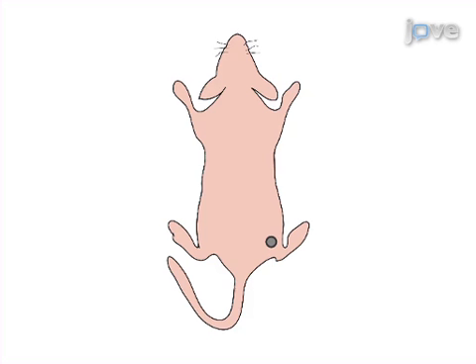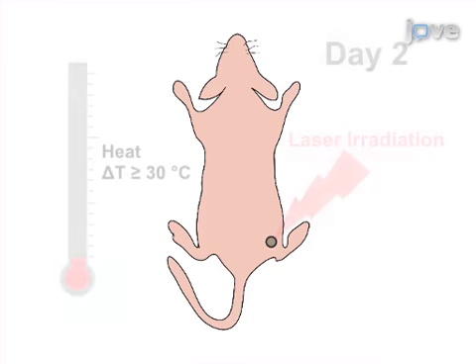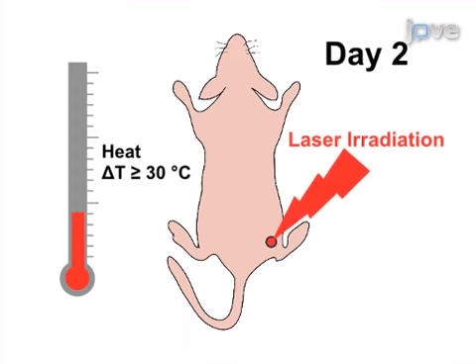The results show that porphysomes are nanoparticles with high homogeneity and highly quenched fluorescence, and that porphysomes are a potent photothermal agent based upon the 100% survival rate of the in vivo animal study.